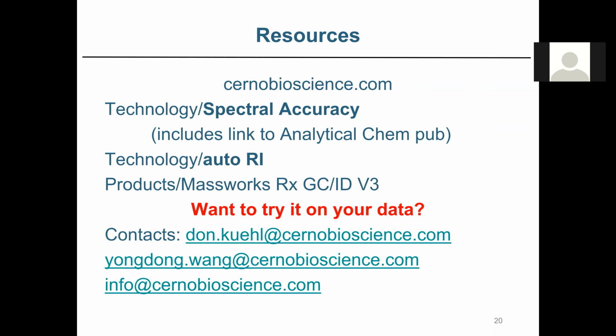This tries to be vendor agnostic, so they don't use the more conventional names for the columns. But those column types, non-polar is basically DB1, if you're familiar with that. Obviously, there are trade names for that, and there are equivalent variations of that. There's DB5, which is semi-non-polar, and that's probably the most common column people use. And then there's a polar, which is a wax column. So those are the three types of columns that there is data for. If you use something that's in between, unfortunately, you're out of luck. The good news is most people will use one of those three column types.